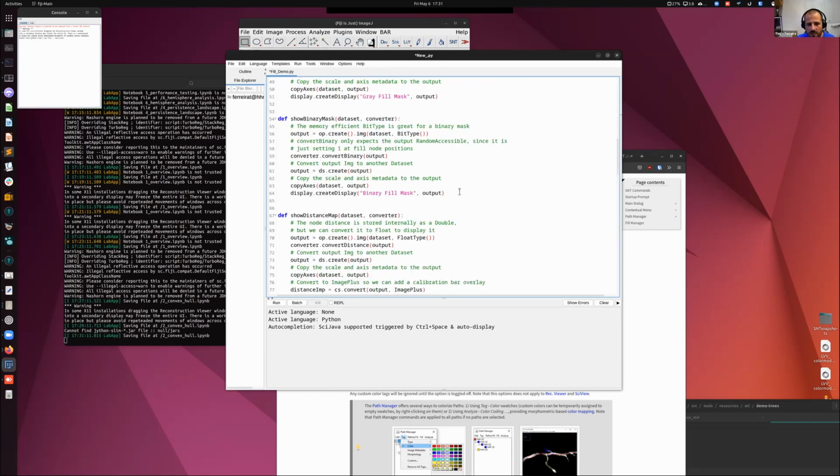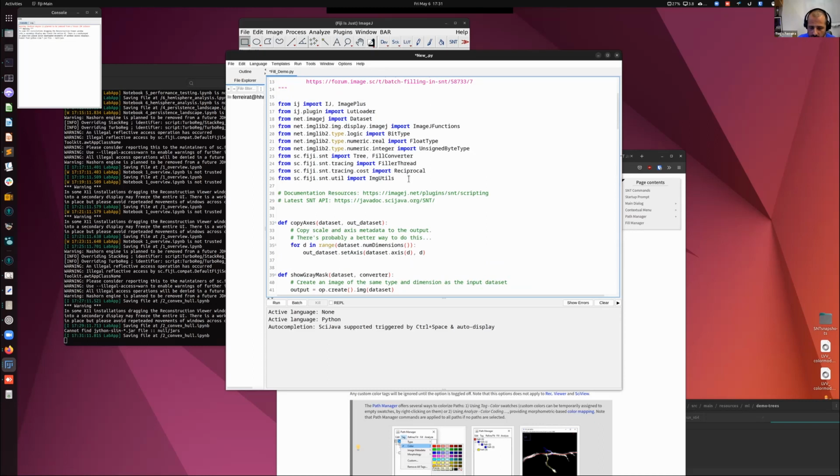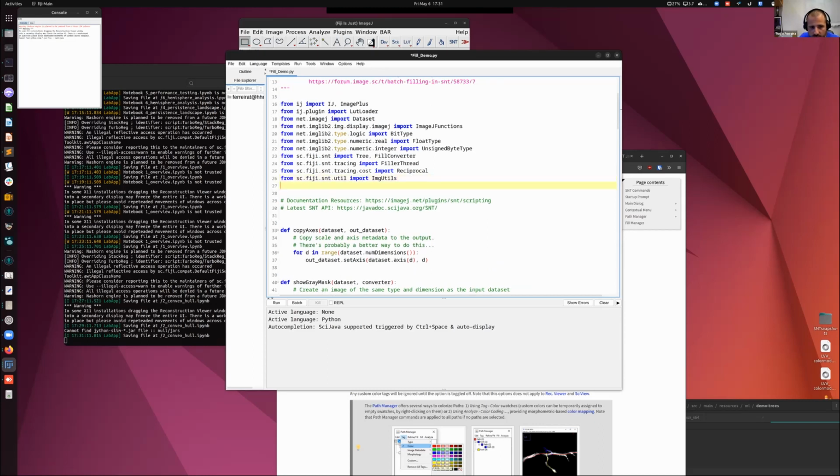One of them, which you may have already noticed, is autocompletion. Especially in Python, you should be able to autocomplete things as you type.